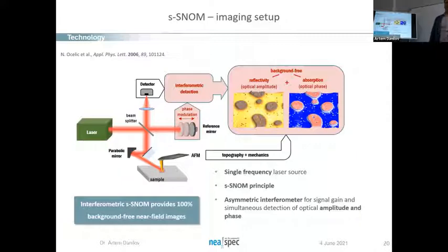It makes no sense to go too high, because in the end, the resolution you're getting in wave numbers is restricted by the length of the interferometer arm. If you put in too many pixels, it doesn't matter, because the resolution is not changing anymore. It's not becoming better. But basically, if you want to get decent spectra, a typical spectral scan takes, I don't know, 2 or 3 seconds on average. Okay. Thank you. I have a question also.